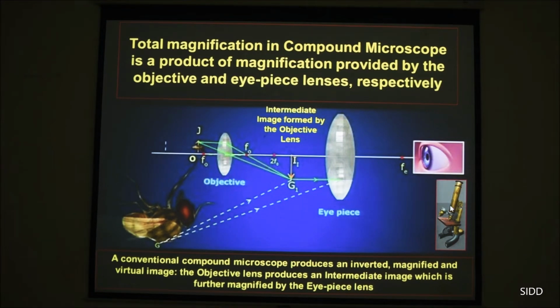And this is what, for example, a microscope like this, which must be expensive because it looks like gold plated or made of brass, that's what it used to be. Which were the microscopes which were actually available. The only addition will be that they will have a third lens which we call oil immersion lens. I will talk about that.